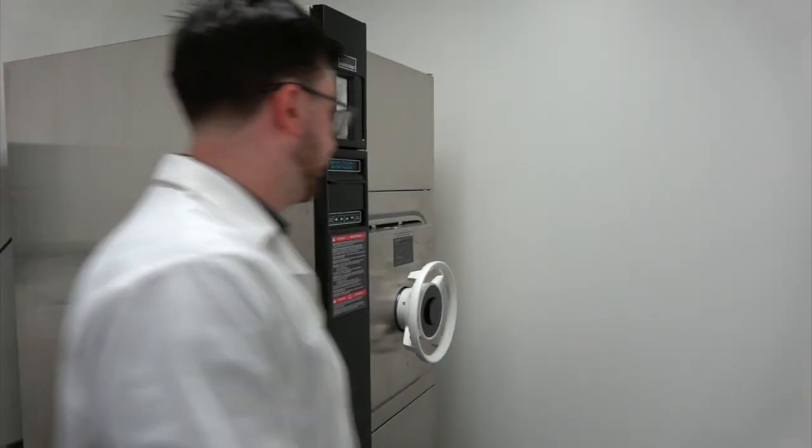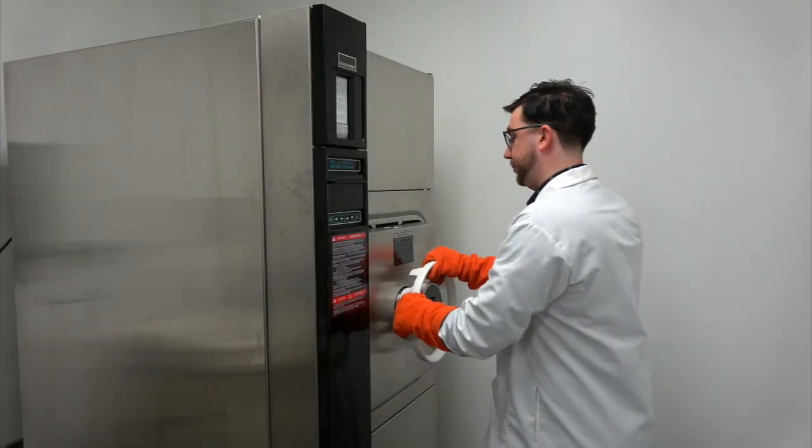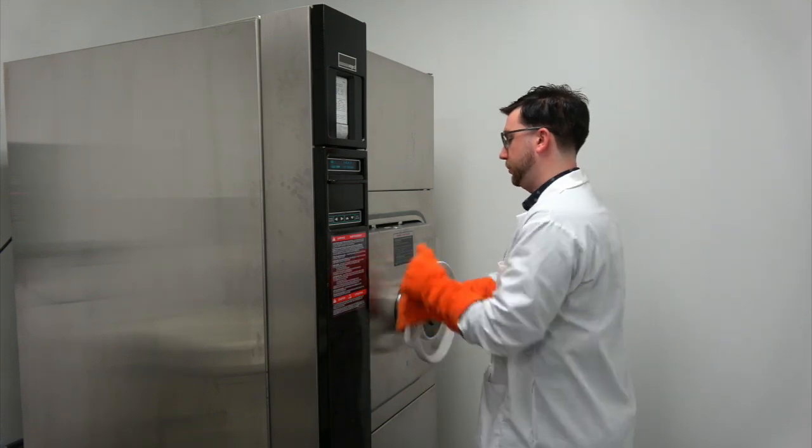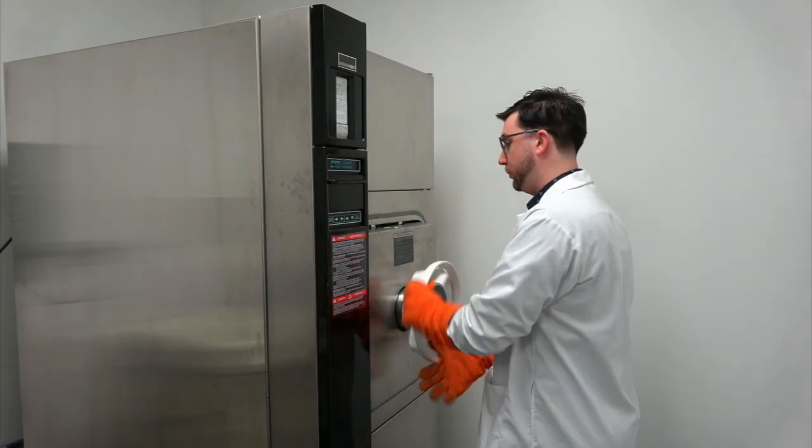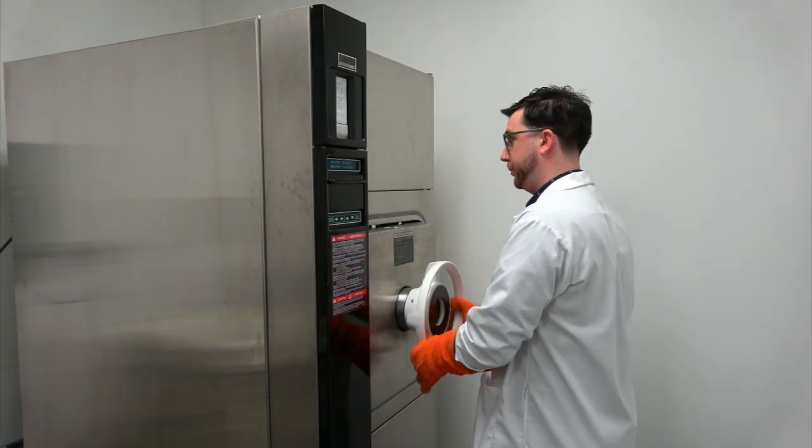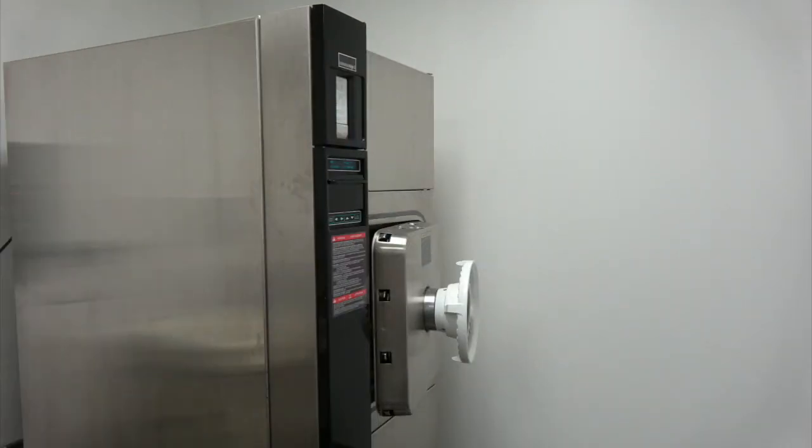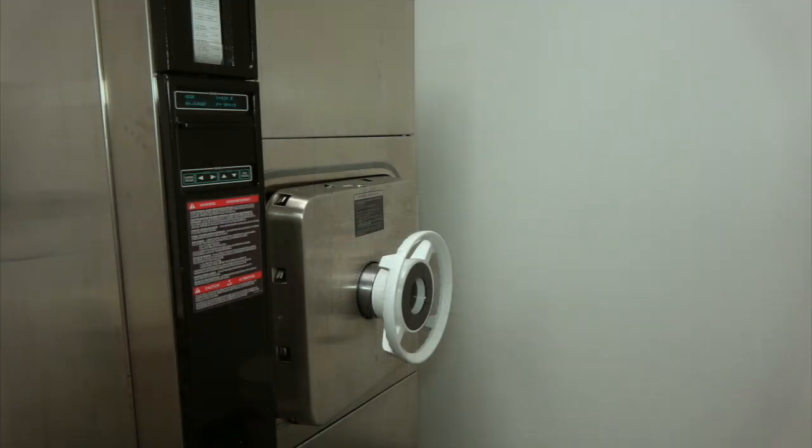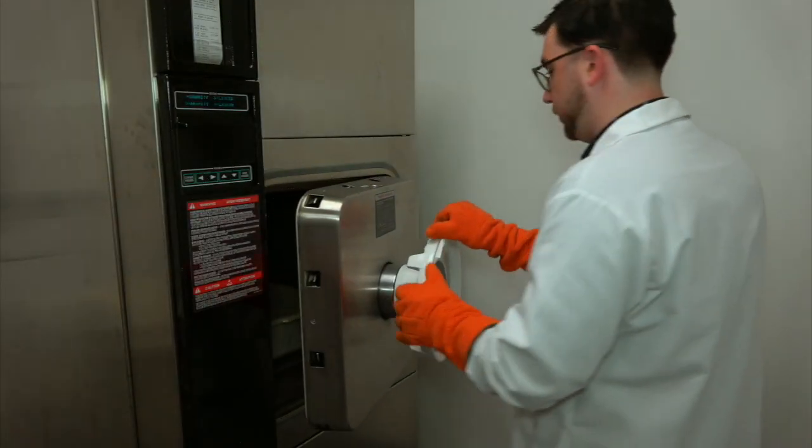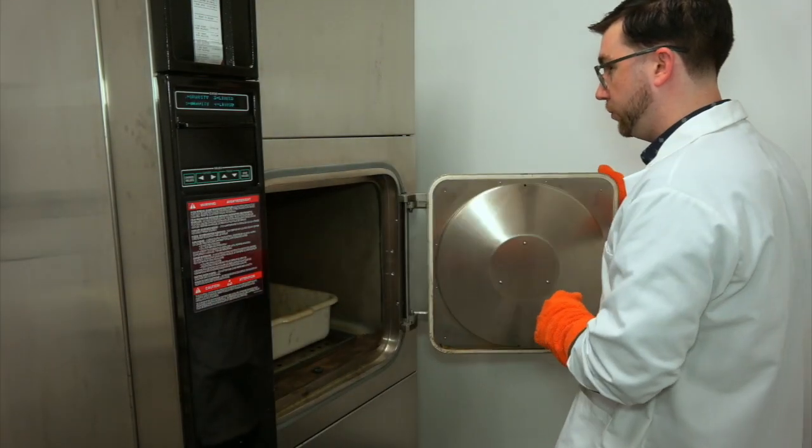Once the autoclave cycle is complete, it's time to retrieve our bottle of molten LB agar. When handling anything coming out of the hot autoclave, you should always wear thermally protective gloves. Before we retrieve our agar, it's good practice to leave the autoclave door open, just a crack, for about 10 minutes. This will allow any excess steam to escape and will cool our sample slightly.